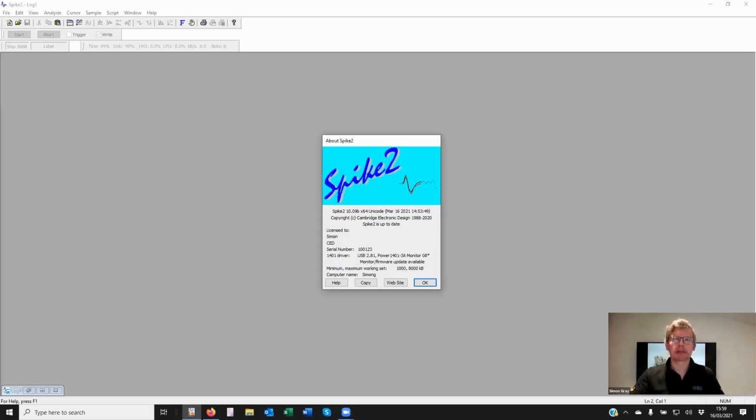This session is Spike2 Graphical Sequencer. As you can see from the screen here, I'm using 1009B. We've made some improvements just recently. Some of these improvements have been due to possible fixes or changes we've discovered would be useful during these training sessions. In fact, we had another modification made to Spike2 this morning just to change the color of the background for the graphical sequencer so you could see more easily some of the icons I'll be placing.